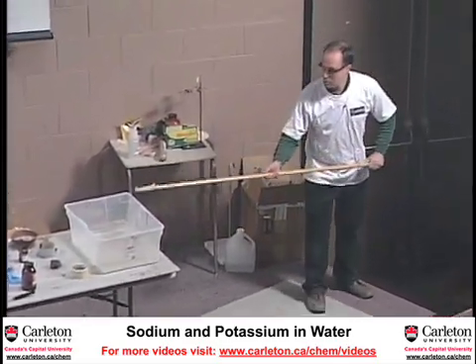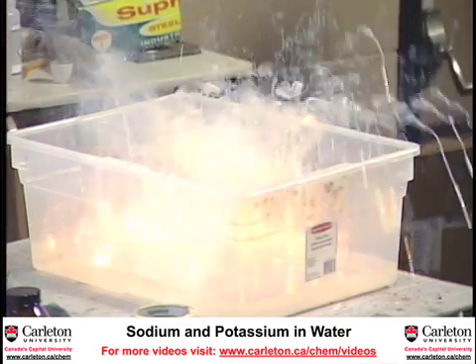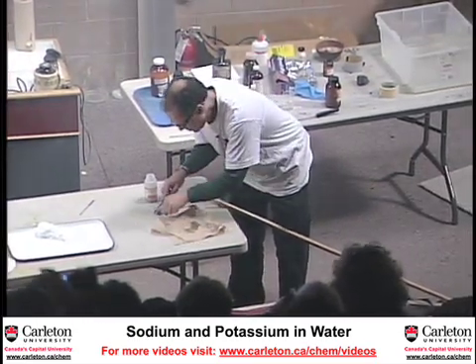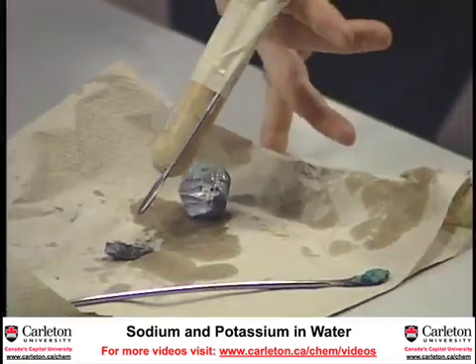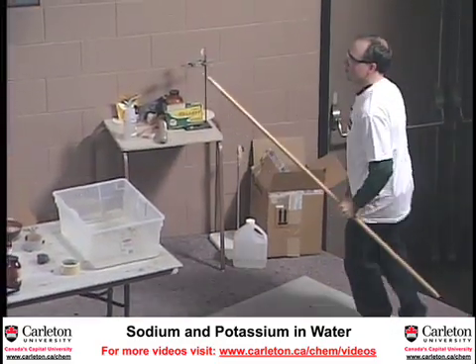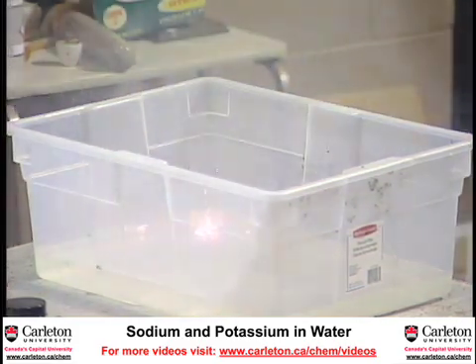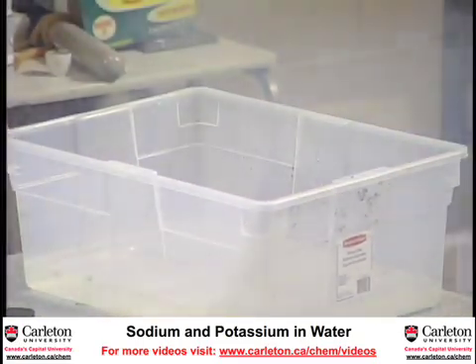If I've got potassium in my lab, spraying water on a fire is the wrong thing to do. Instant flame. What's happened is that the reaction generates hydrogen, and then the hydrogen explodes into flame. Usually it pops. So that's why you don't spray water on sodium or potassium.